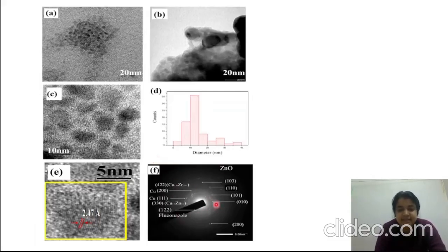The resulting TEM images will be a series of spots constituting the selected area diffraction pattern. This is basically the selected area diffraction pattern. Here we can also get a series of spots or some rings, right? Each spot corresponds to a satisfied diffraction condition of the sample's crystal structure. If the sample is tilted, different diffraction conditions will be satisfied and different diffraction spots will appear.